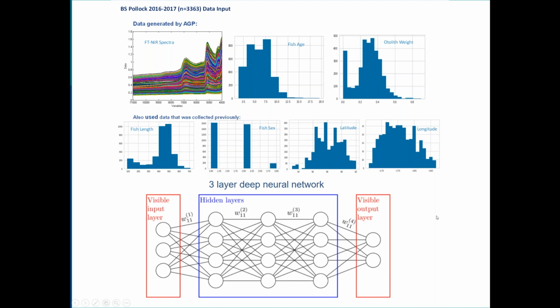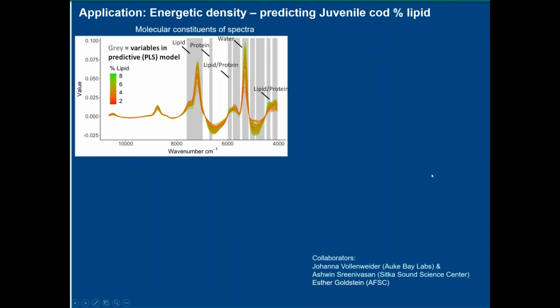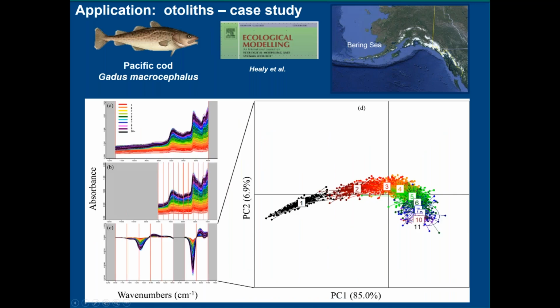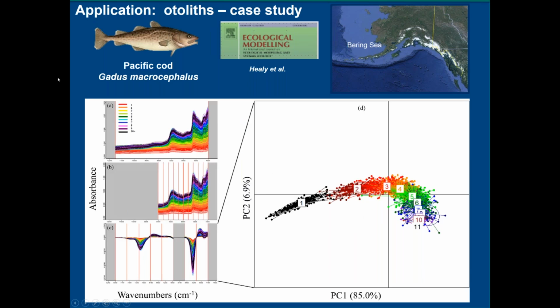But jumping right in, and some of these are a little bit overlapping, and they almost all focus on otolith questions. The first one comes from Dr. Timothy Lohr, and says, you've suggested that the primary age-dependent change in absorbance profiles is related to nitrogen-carbon dynamics, which suggests some manner of age-dependent shift in the otolith matrix. Is there any evidence supporting hypotheses regarding the molecular nature of that shift? For example, fundamental changes in either protein to amino composition or molecular conformation amongst protein units, or changes in the relative proportion of protein to carbonate, or the manner, for instance, binding regions in which the carbonate binds?